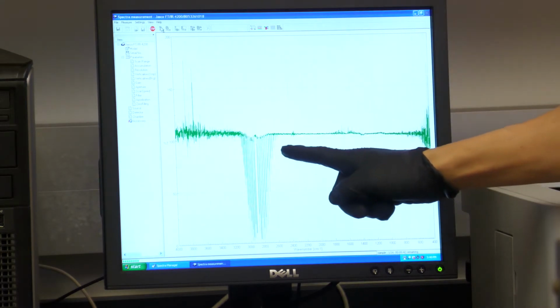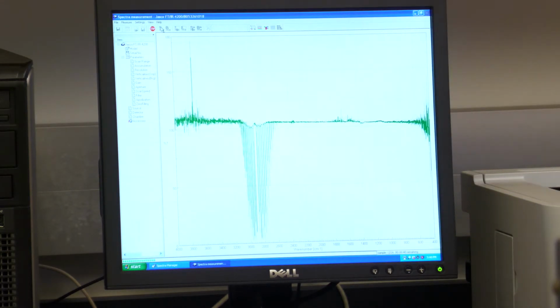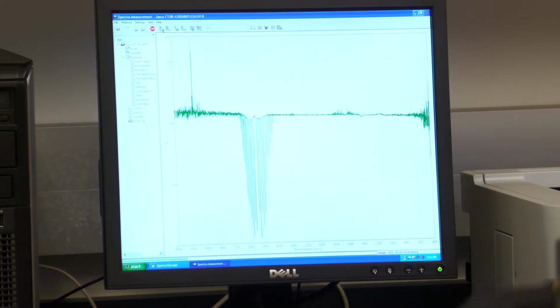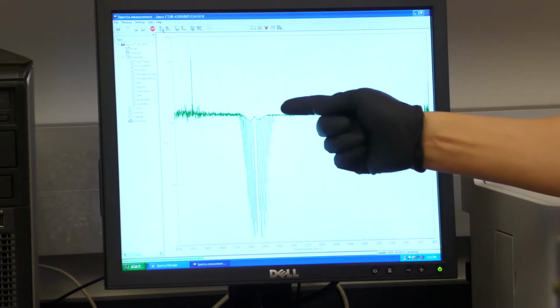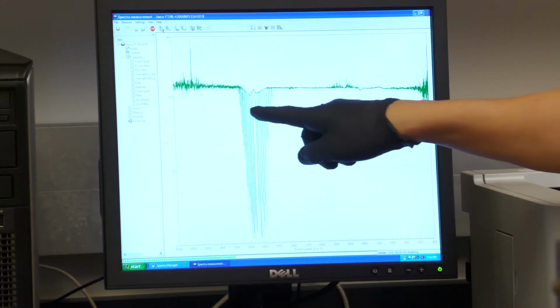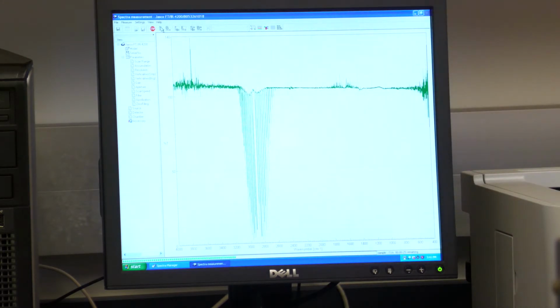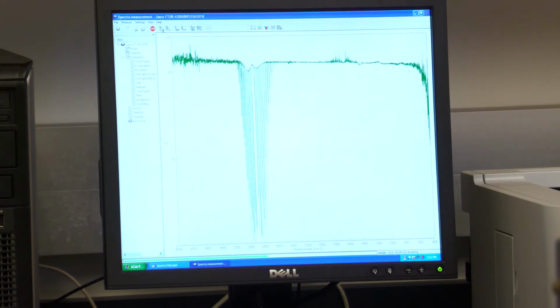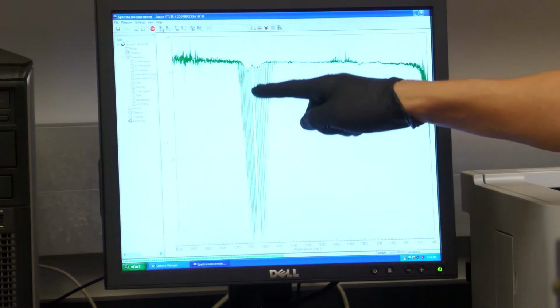Let's click the sample to see what happens. Okay, so you can see this is the HCl spectrum. This plateau is actually vibrational. This individual structure is rotational. So this is rotational on top of vibrational. In the handout, you can see we will miss the center part.